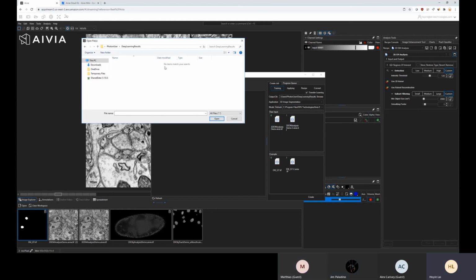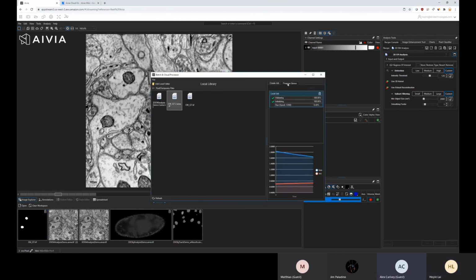Essentially, if you're in this folder, we will save all of the epoch info, the model, at the end of each epoch. And if you already find something that is pretty good, you can just stop the training and take the model. It will not destroy the ongoing model.